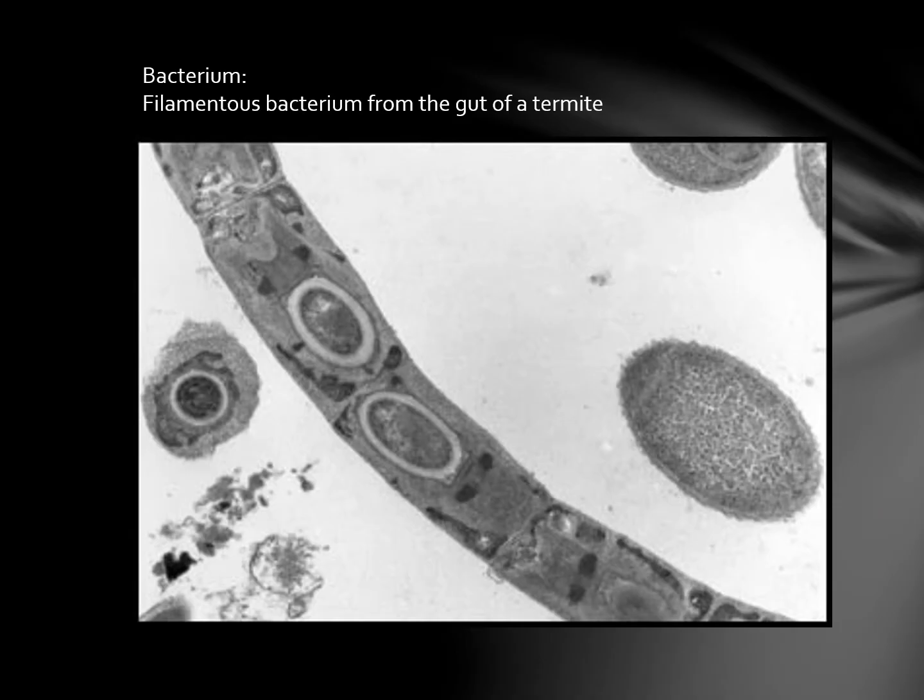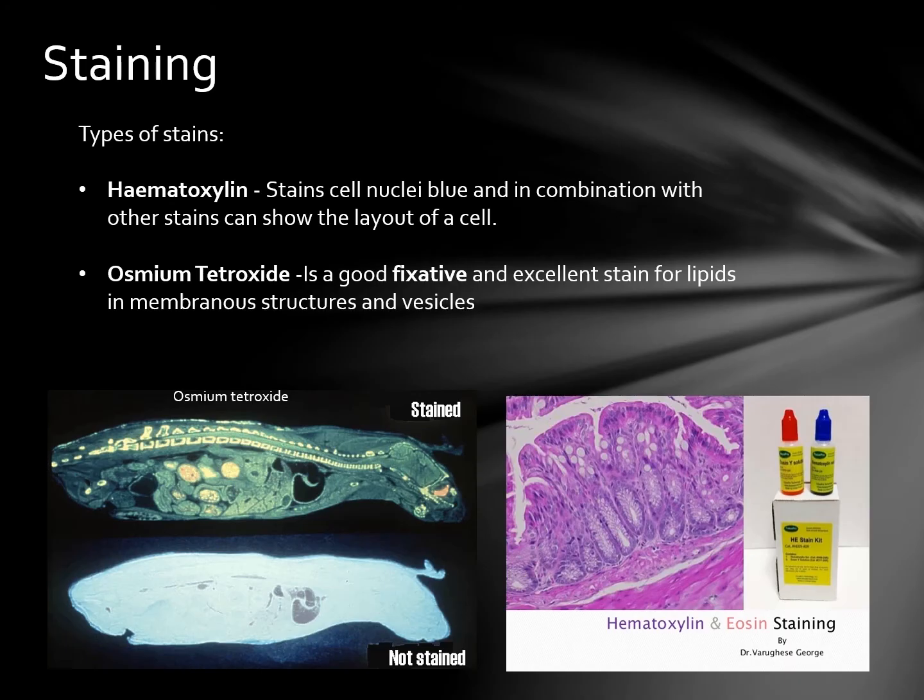Here is a sample of a bacterium. Note the fine structures in the very good image presented by the proper staining method. So the stains we are discussing here are just the most popular. There are many products out there available for each type of sample.